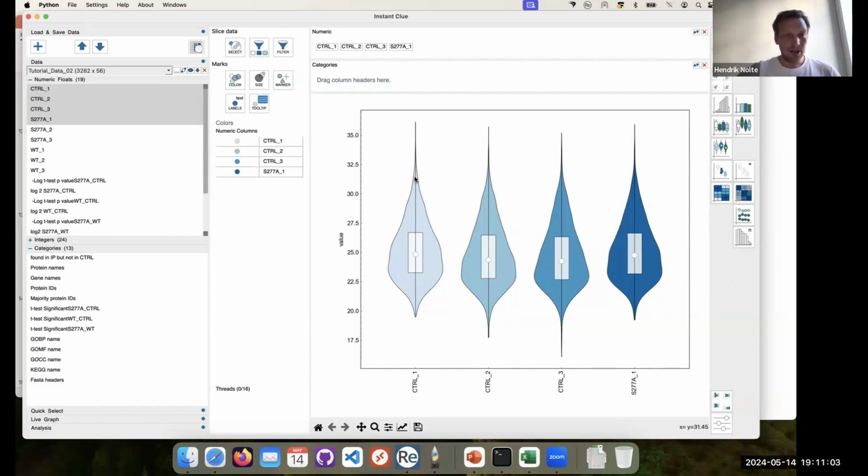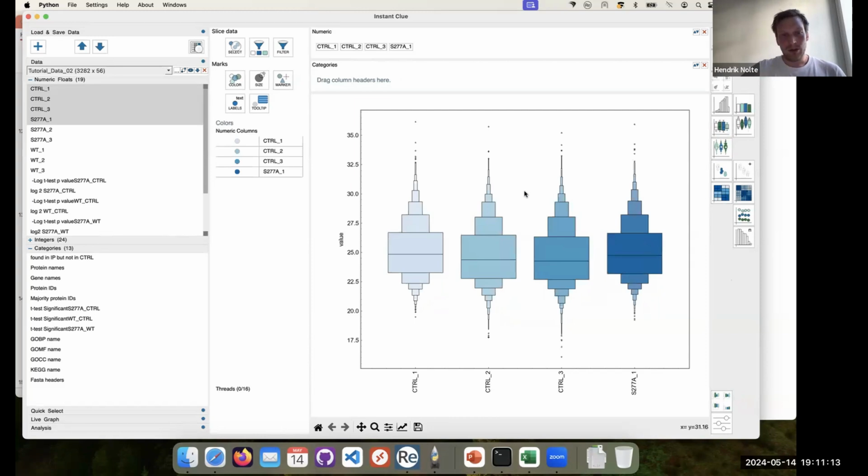Or we can use, which is actually recommended for very large data sets, so speaking 10,000, the so-called Boxen plots, which is very similar to a box plot, but divides the data into more separate boxes. It's called a Boxen plot, therefore, and it's often able to visualize differences more at the tail of the distribution. So for very large data sets, it's recommended to use this one.